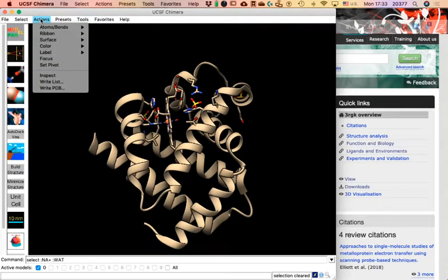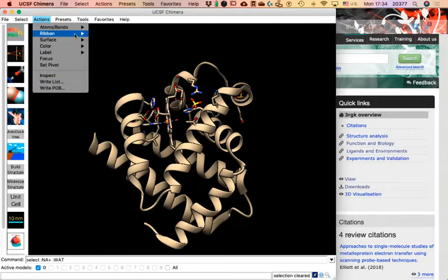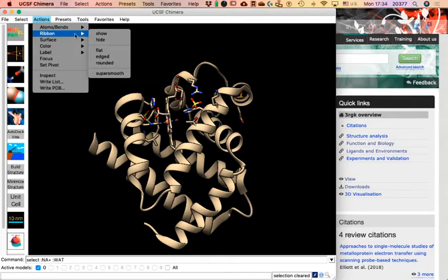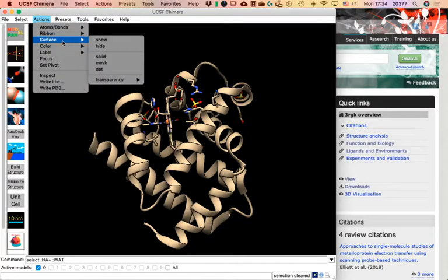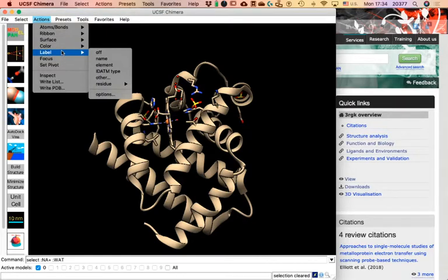These actions might seem like cut-and-paste or format-changing in Word, but they are more like changing the way things look. Under Atoms and Bonds, all actions change how atoms and bonds appear — balls and sticks, spheres, wire, and so on. I can show the protein or nucleic acids as ribbons, show protein surfaces, change colors, change labels, etc.